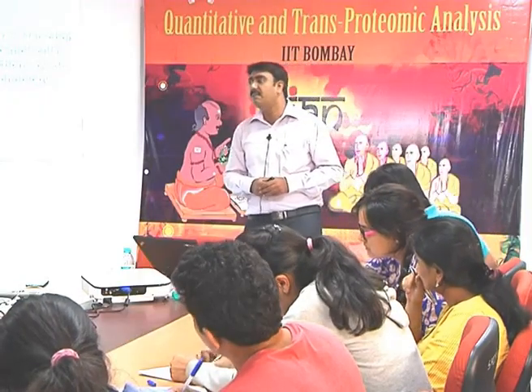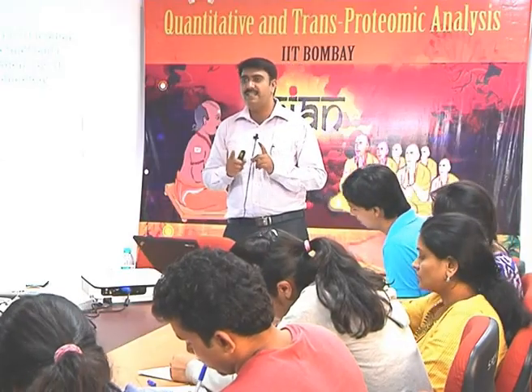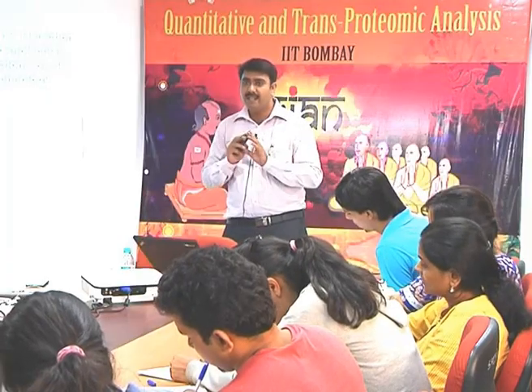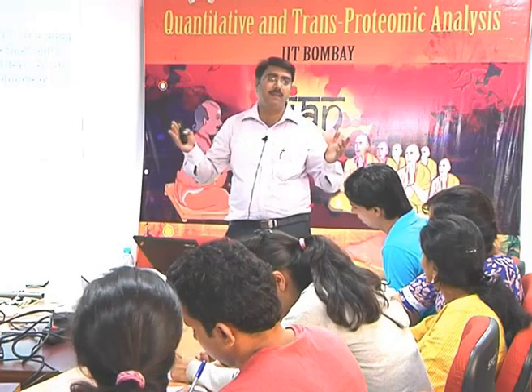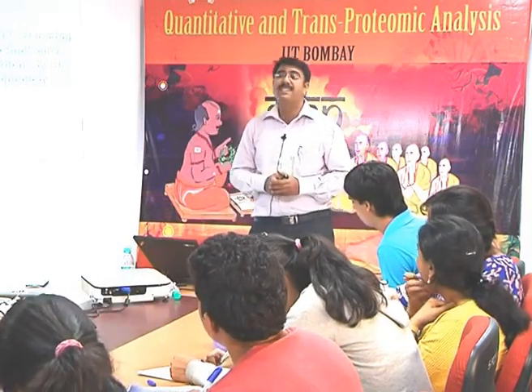BLI is nothing but biolayer interferometry. SPR technology is surface plasmon resonance. Here we have the BLI technology. The technologies are different, but the output from SPR or from BLI is the same. Okay, so how exactly does this technology work?